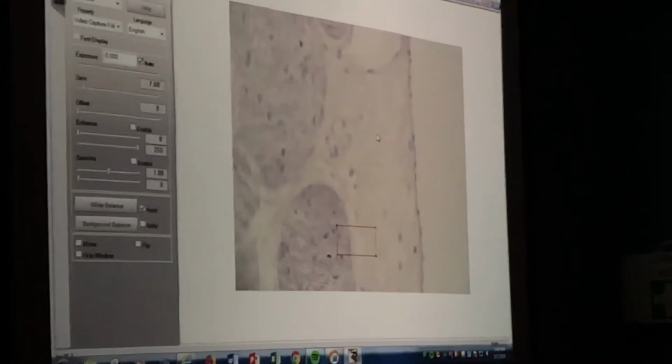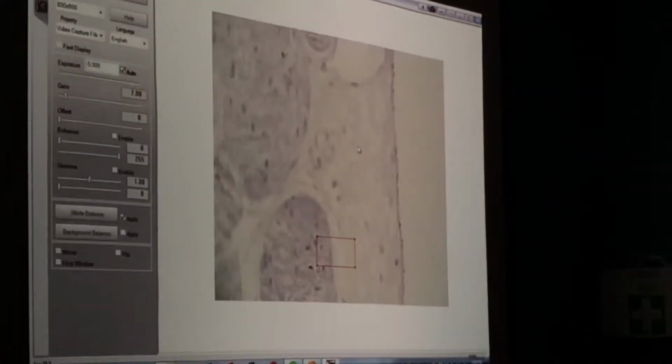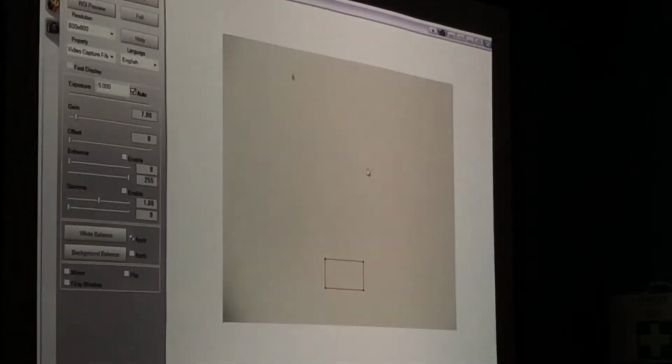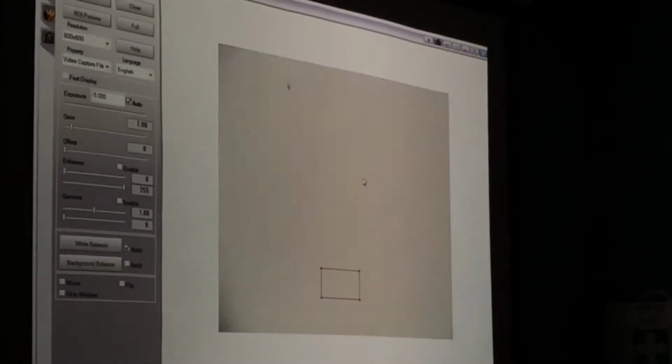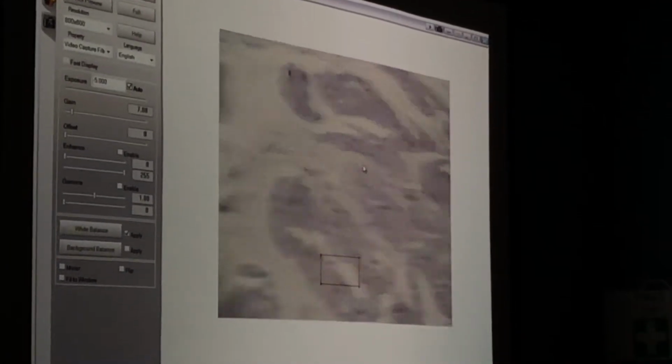And then way out here in the back, we will see what? So we have a mucosa, muscularis, adventitia. Yeah. Alrighty? Questions about that?